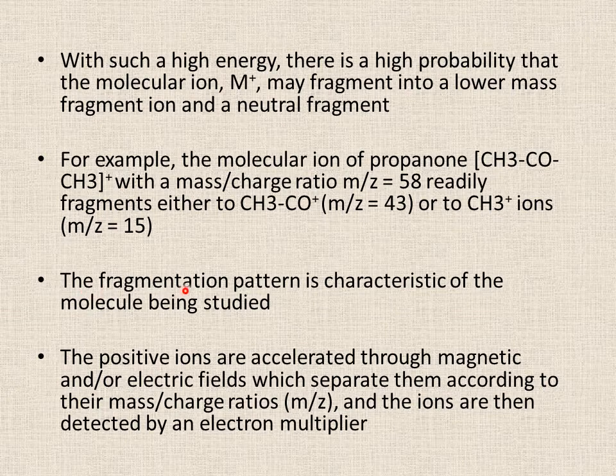The fragmentation pattern is characteristic of the molecule being studied. This means what fragments will be formed varies from molecule to molecule. Each molecule has its own fragmentation pattern. The positive ions are accelerated through magnetic and or electric fields.